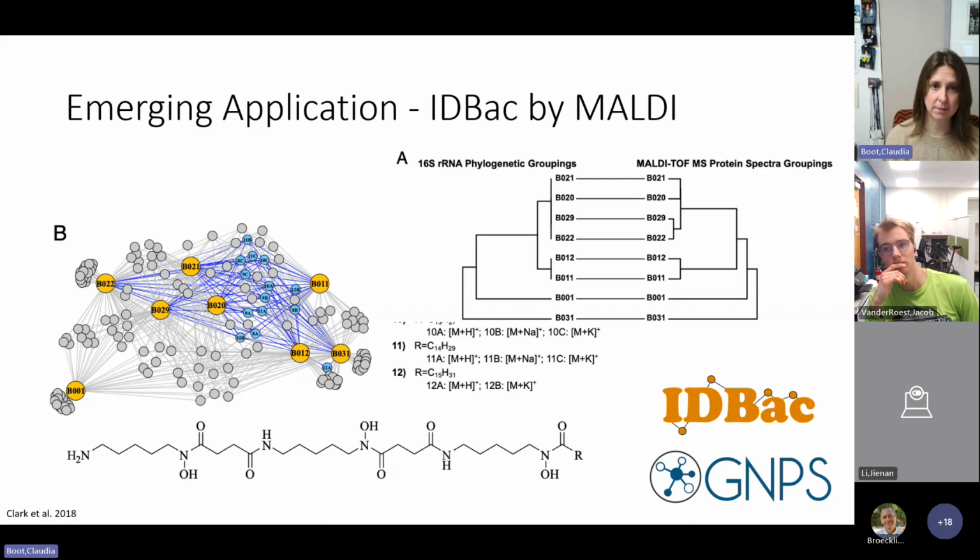So if you're doing some kind of metabolic analysis, or you have a culture collection that you're curious about, their metabolic potential and how they process different things, this is a really powerful tool that has this ID-BAC workflow that's being built into the GNPS2 platform that's in beta testing right now, and we're participating in the beta test for this to make it more widely available. So that'll be coming online soon.